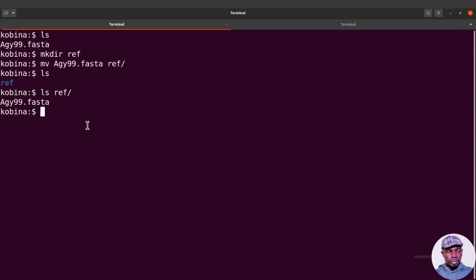I also suppose you have installed Nextflow, so we are now going to write the script. I'll take you through it step by step, so don't worry, you don't need to have any programming experience, just follow whatever I'm going to give here. So we will start with our first script. I'll use Nano to open a text file and edit. You can use any other text editor also, that's fine. So I'll say nano script1.nf because we are going to create other scripts. You can use any name of your choice, that's also fine. Alright, so I'll say nano script1.nf.